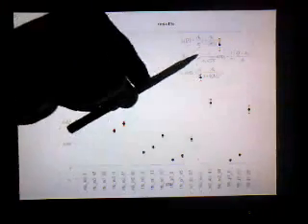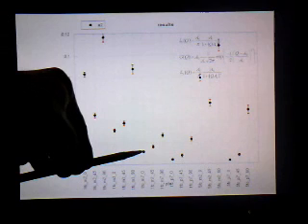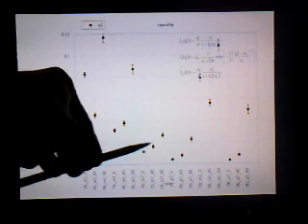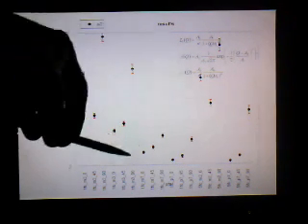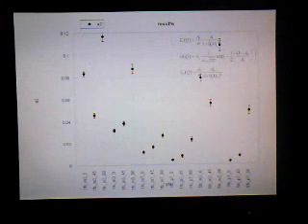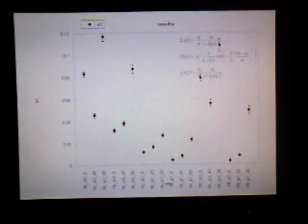This is the A2 parameter, which is the amplitude of the Gaussian. What's interesting is there's fairly systematic behavior here as you go from 0 degrees between Q and the applied field to 45 to 90. You keep increasing the value of that amplitude for whatever domains are contributing to that Gaussian. It becomes more and more noticeable as Q becomes perpendicular to the applied field. So that's saying that the domains that contribute to the Gaussian have magnetization parallel to the applied field.